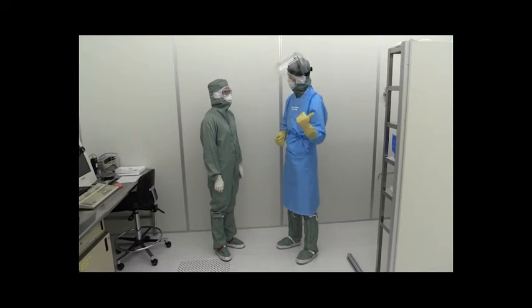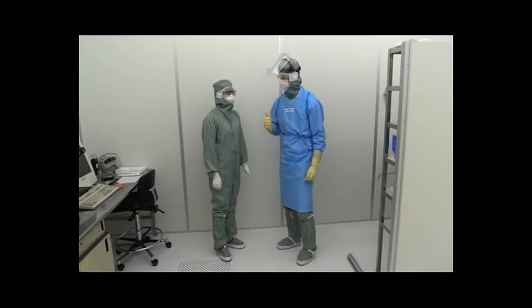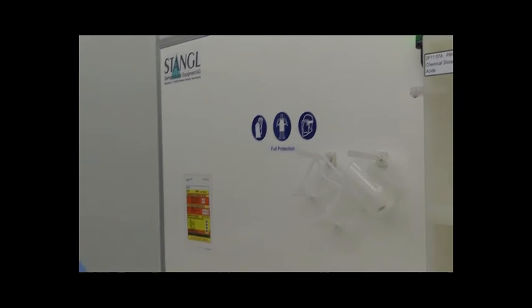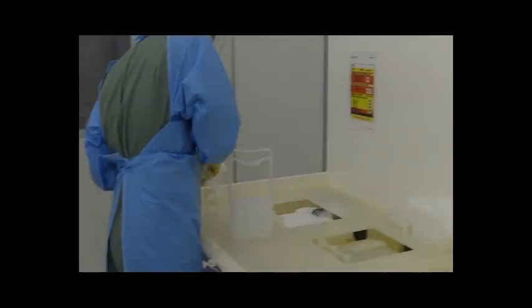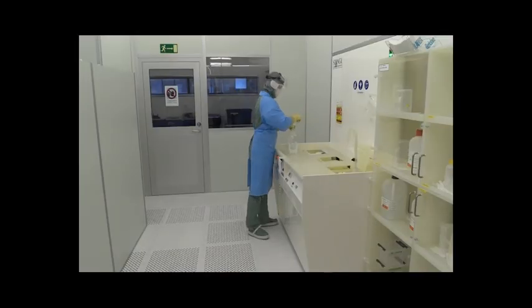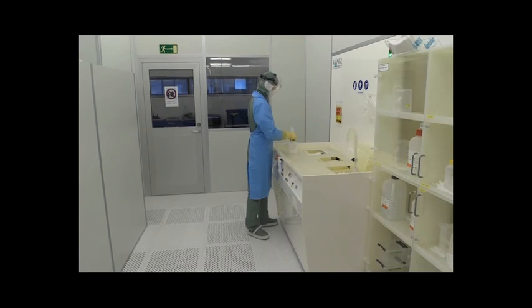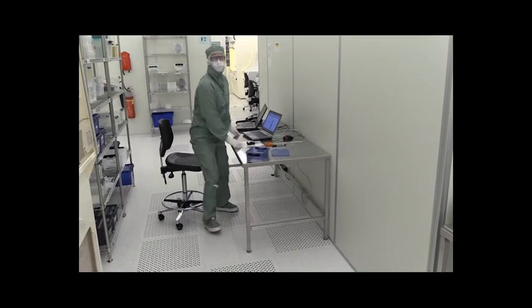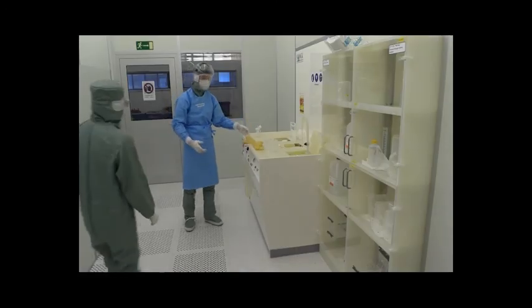You should also remember that you are not allowed to work with chemicals when you are alone. Particularly outside normal working hours and during weekends you must have a lab buddy present. The lab buddy is another cleanroom user who agrees to stay nearby as long as your work requires.